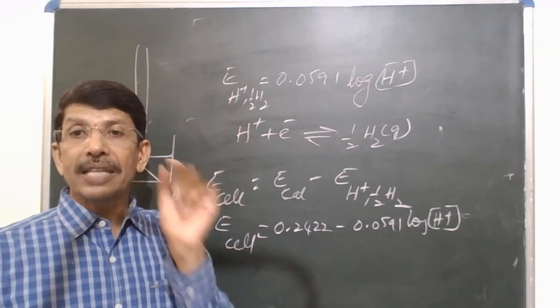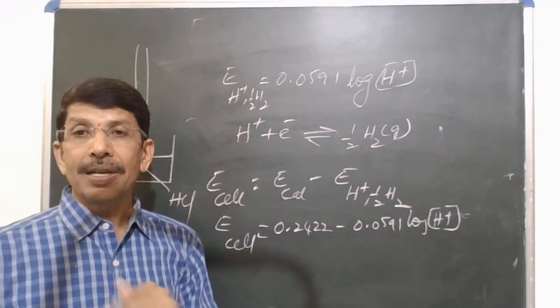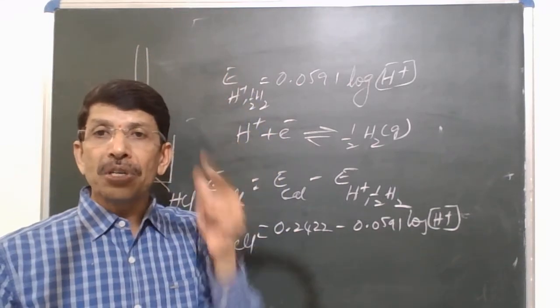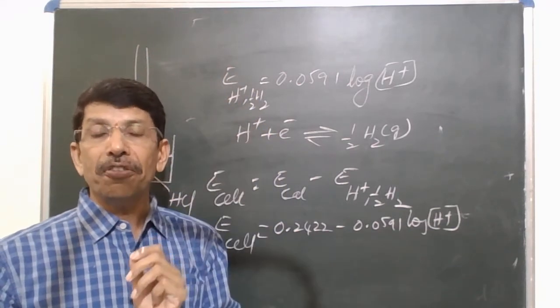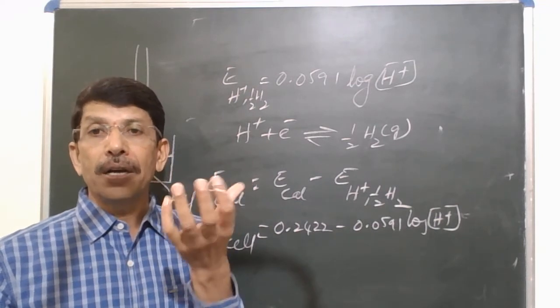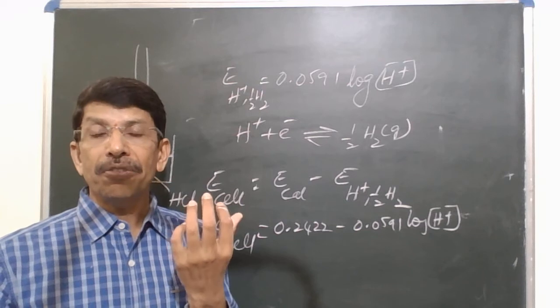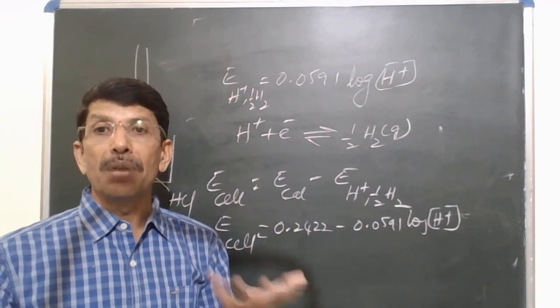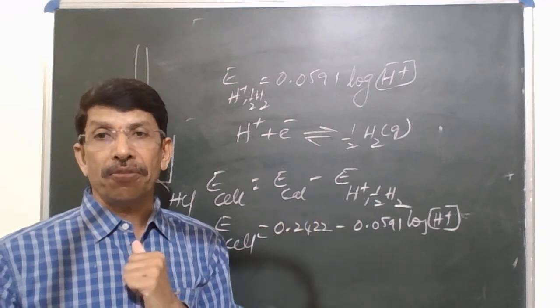Till the equivalence point, EMF gradually increases. At the equivalence point, there is a sudden increase. So once you observe a sudden increase in the EMF, after the sudden increase, take 4-5 readings of EMF, then stop. Then plot a graph of volume of NaOH versus EMF.